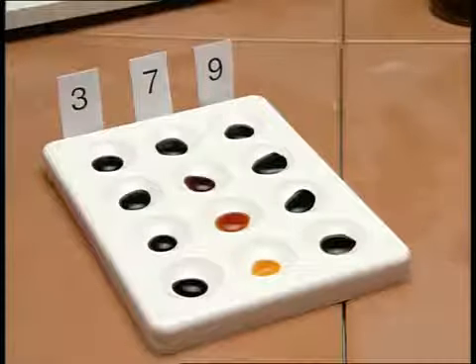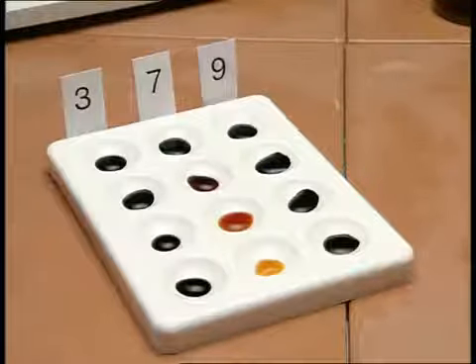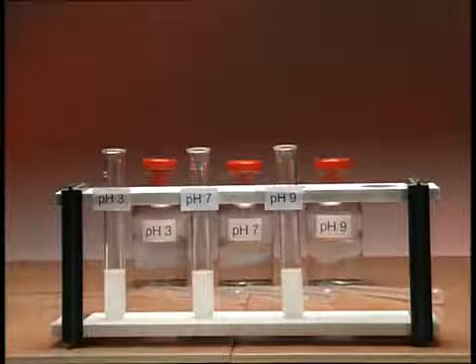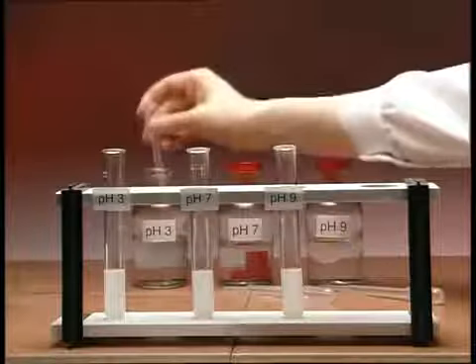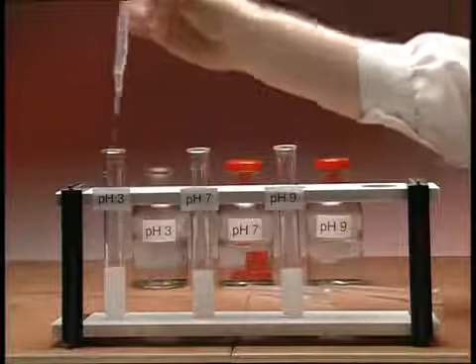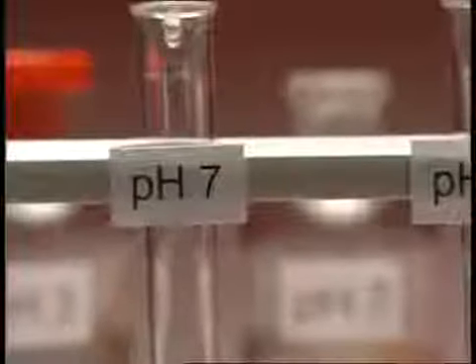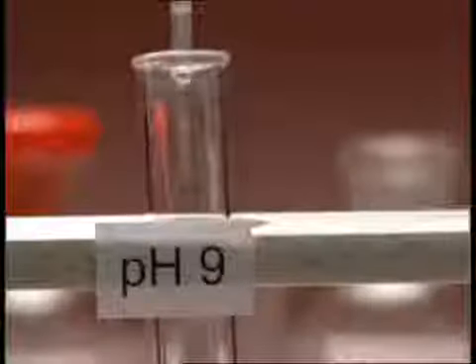Here, salivary amylase works best at pH 7. This is its optimum pH. Next, we investigate pepsin, which is released in the stomach. There's protein, egg white solution, in these 3 test tubes. An acid is added to the first. A neutral solution is added to the second. An alkali is added to the third.